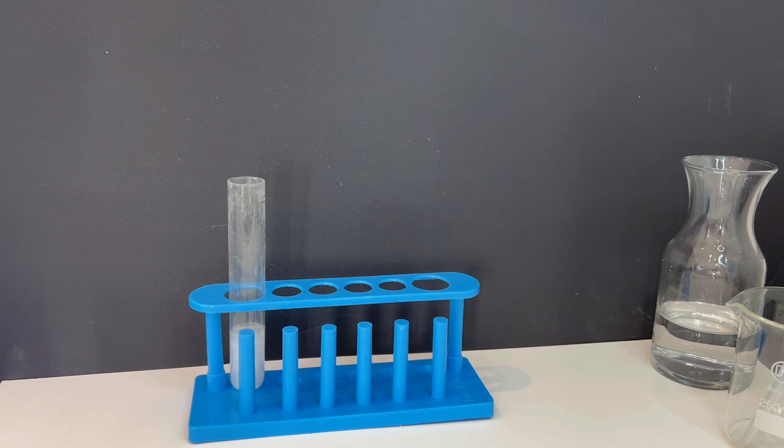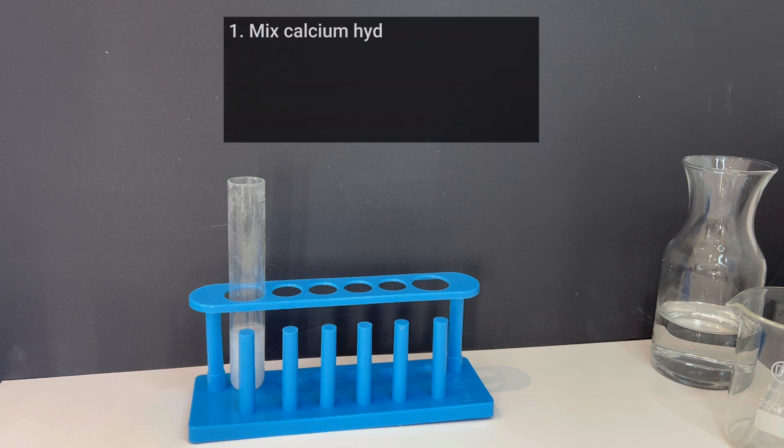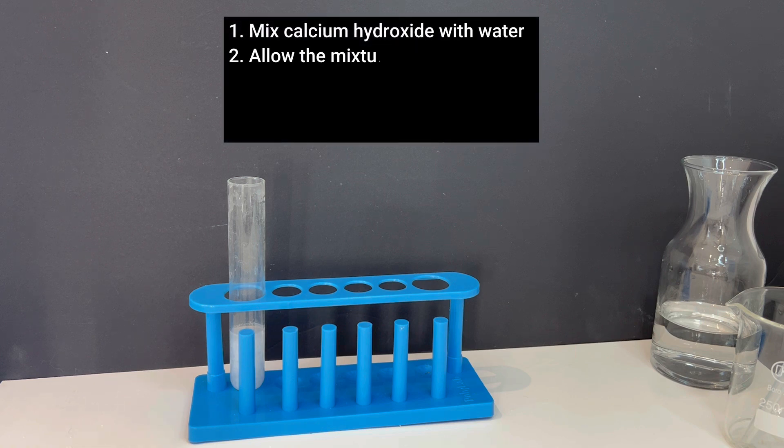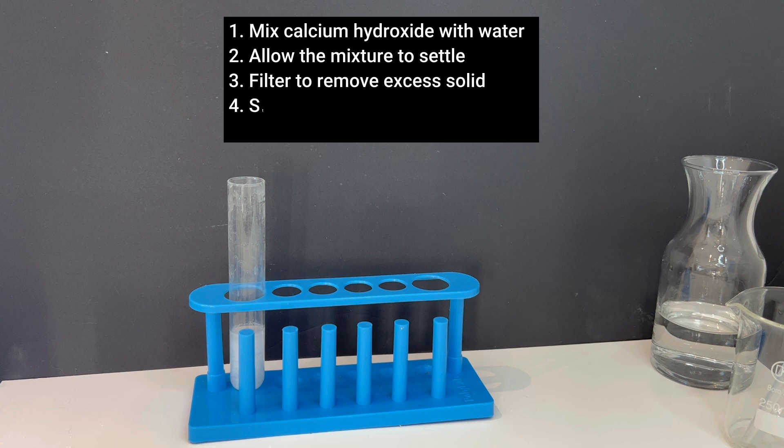So let's quickly recap. Mix calcium hydroxide with water. Allow the mixture to settle. Filter to remove the excess solid. Store the clear liquid as lime water and use it to test for carbon dioxide.